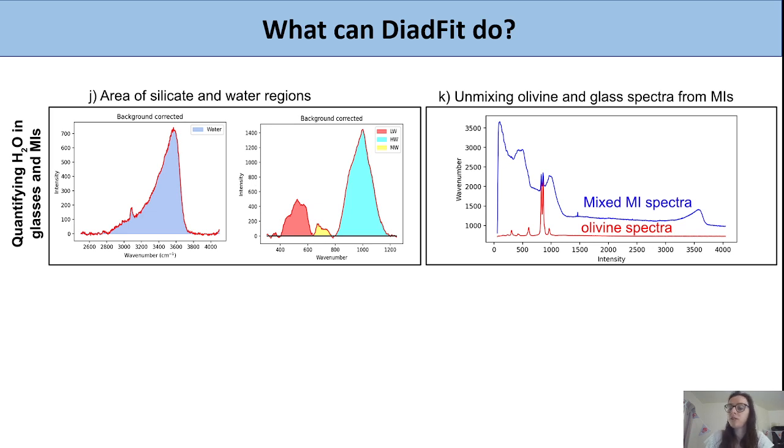A new thing it can do: you can collect spectra on melt inclusions at a certain depth in the crystal. Obviously that Raman spectra is currently a mix of the overlying olivine and the glass. If you can take an olivine spectra right next to the melt inclusion, you can actually unmix those signals. That allows you to get a pure melt inclusion spectra on an unexposed melt inclusion.